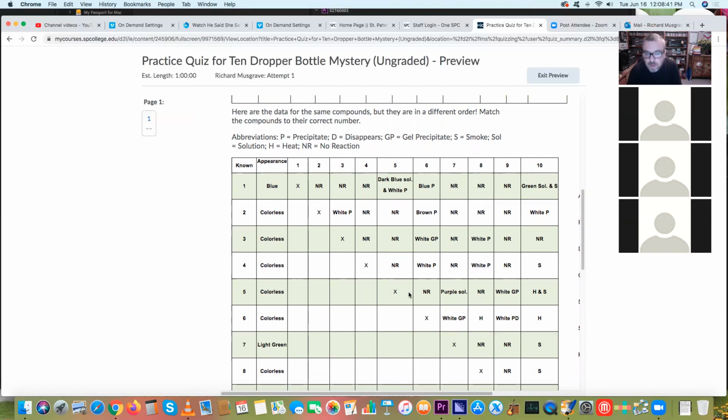Just look for the unique things once I know what something is. It's kind of like a cascade at that point, because you get more and more information about what's what, and then it becomes even clearer how to figure out which number goes with which compound.